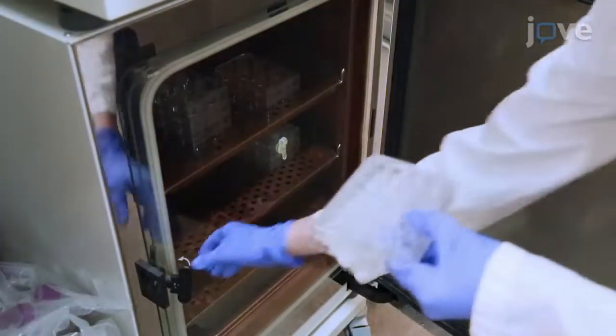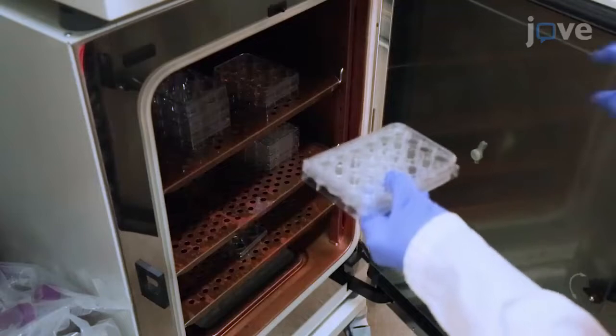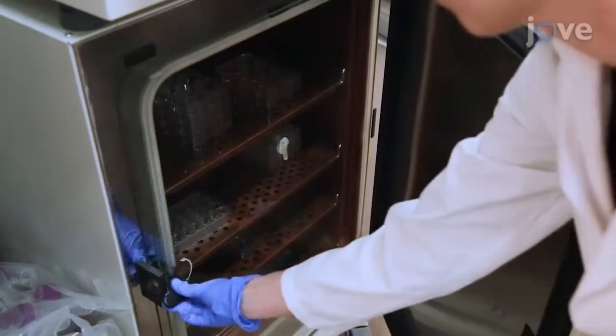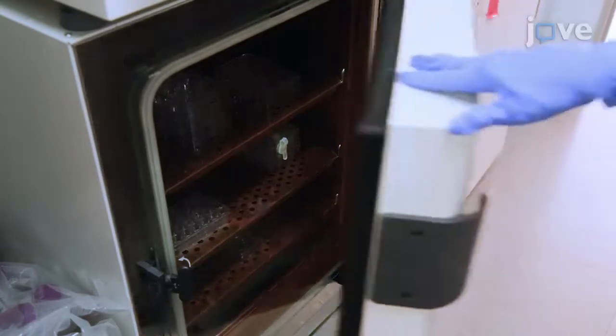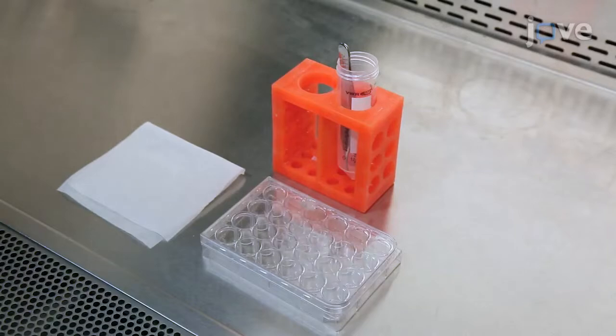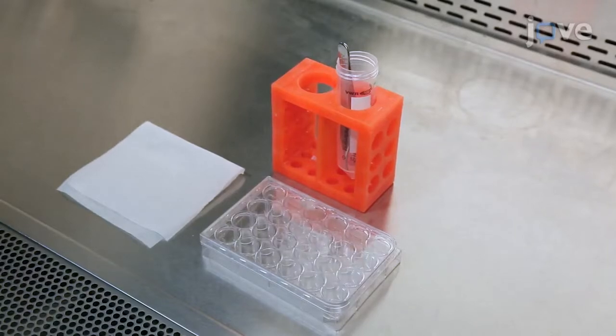Cover the 24-well plate with a lid and place the plate into a tissue culture incubator at 37 degrees Celsius for two hours to permit the ECM solidification on the membrane. After two hours, remove the plate from the incubator and place in a tissue culture hood.